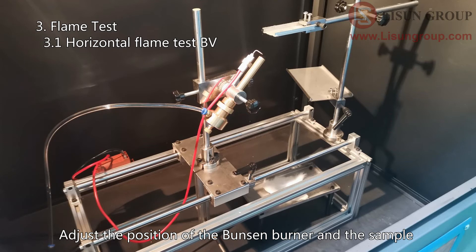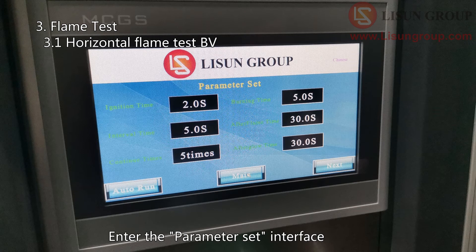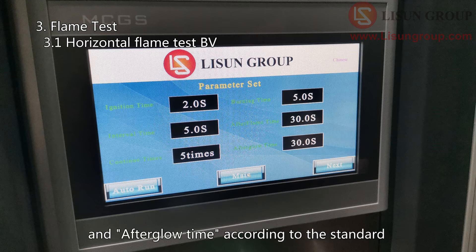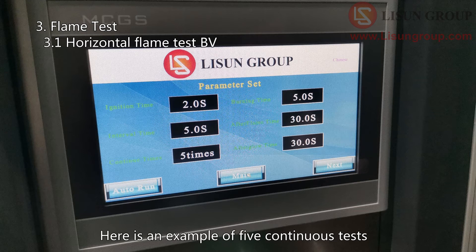Adjust the position of the Bunsen burner and the sample according to the horizontal flame test standard. Put the cotton on the residue collector. Enter the parameter set interface. Set the ignition time, burning time, after-flame time, and after-glow time according to the standard. If continuous testing is required, set the interval time and continue times. Here is an example of 5 continuous tests.